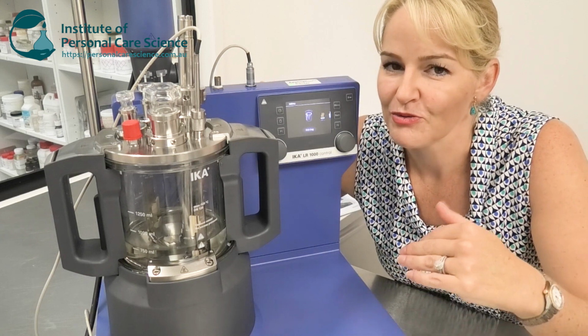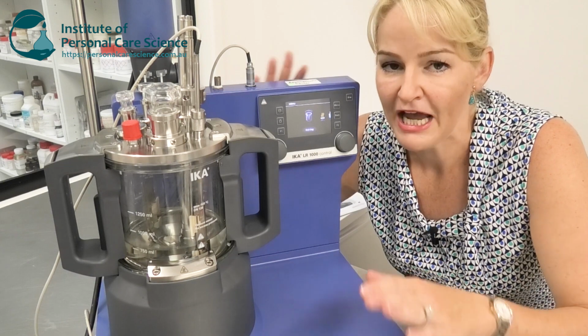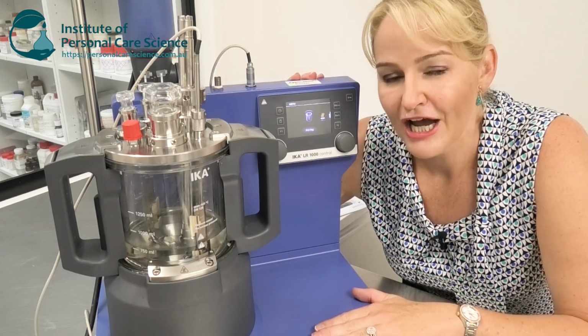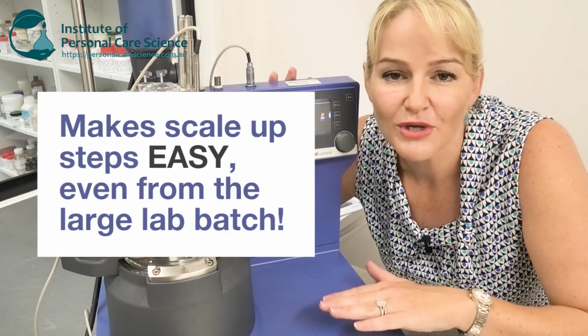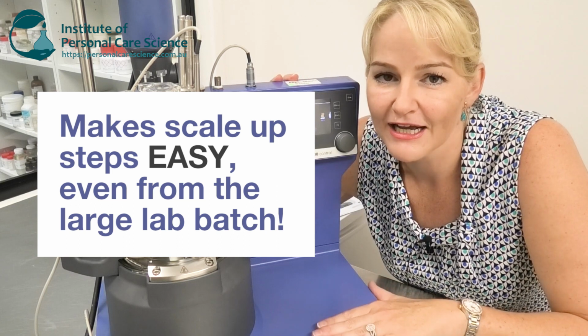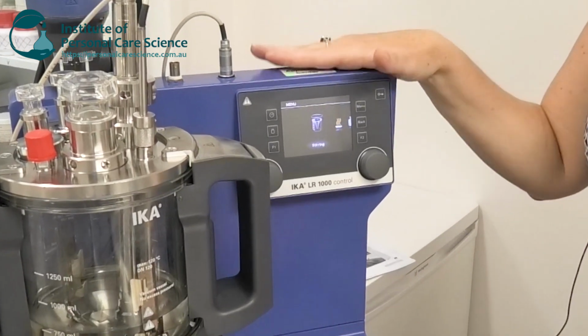One of the problems when we make a large lab sample is we're often using lab equipment rather than trying to replicate what would happen with larger machinery. This machine here helps us replicate what we would then scale up to in a pilot or full production batch, which means scaling up later has far less chance of failing and much bigger chance of success at every scale up step.